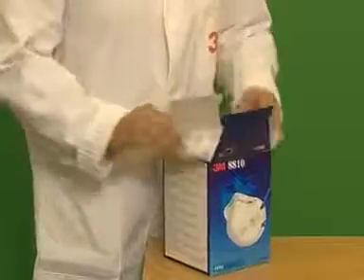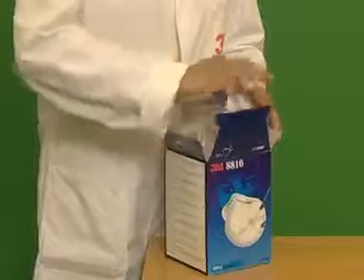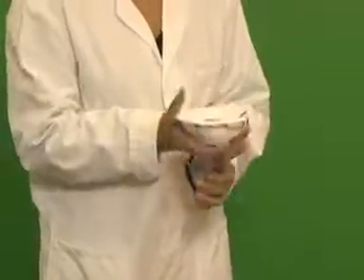Remove the respirator from its box. Cup the respirator in your hand with the straps hanging freely. Place the respirator onto your face, then position the top strap on the crown of your head and the bottom strap below your ears.